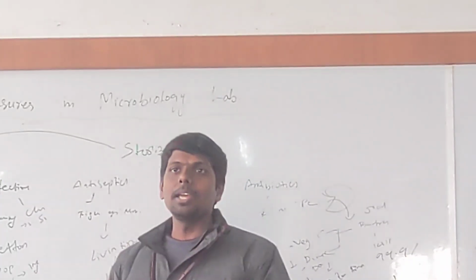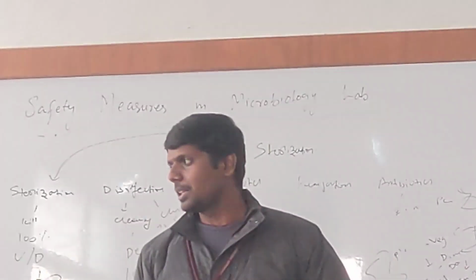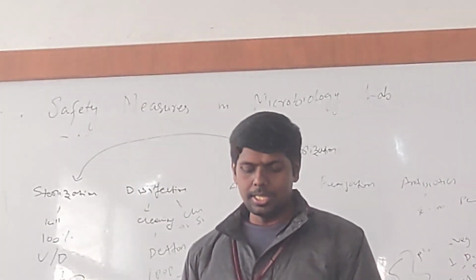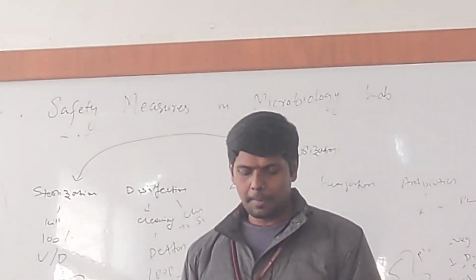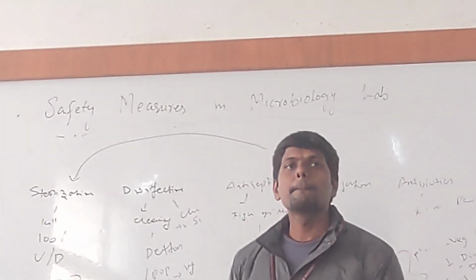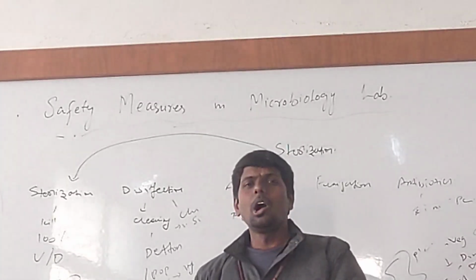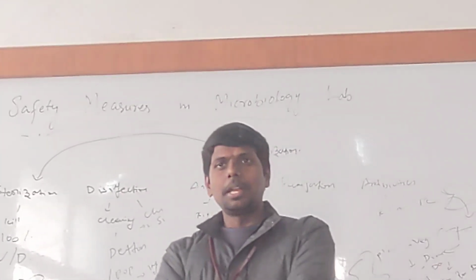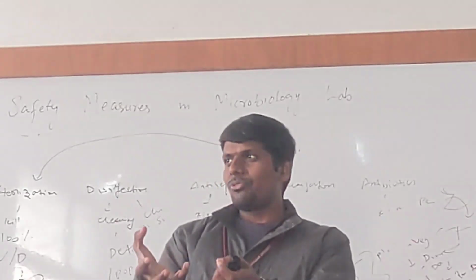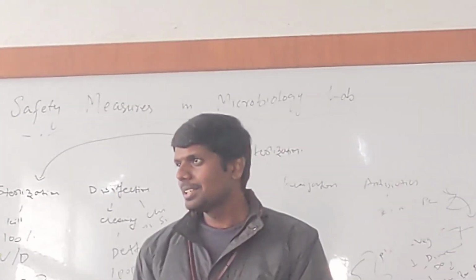How can we kill microbes? Methods of killing microbes. Think realistically. How can we kill microbes? Can I torture a microbe by keeping it on fire? Microbe on fire? We can, right?